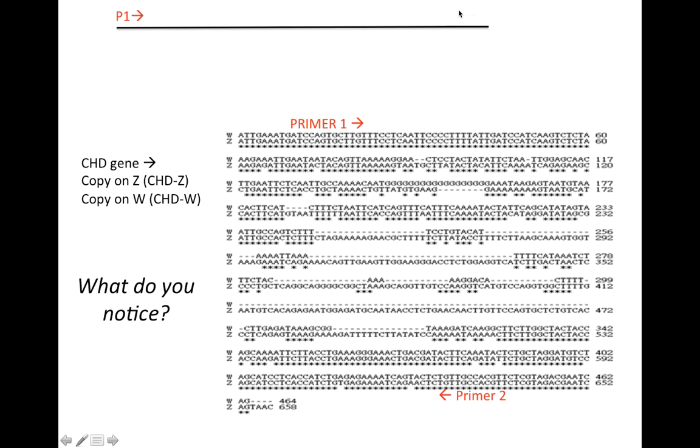We're going to end up with a DNA over time that is the length from here to there on the W. And so actually, we can see it's about 430 nucleotides. Okay, this is nucleotide 462. So here, we're around 430. So the distance from here to there is about 430 nucleotides on the W.